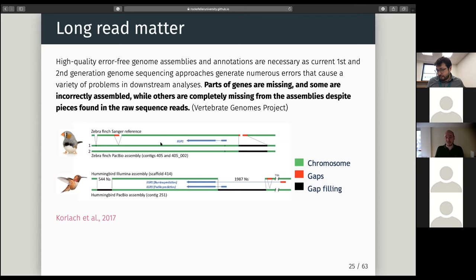It could mix exons. You could have frame shifts that are introduced artificially. You could have a lot of things. So one thing I always say is never trust the reference genome you're using, or whatever reference genome you're looking at. Reference genomes contain a lot of errors, even the high quality ones. So never trust the sequence as it is. Try to validate as much as you can, because they contain a lot of these kinds of problems.